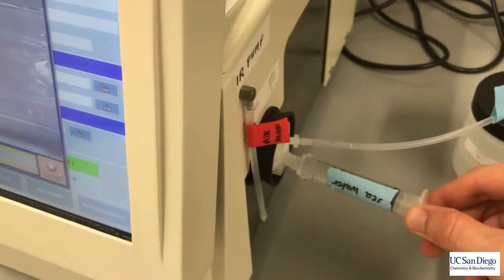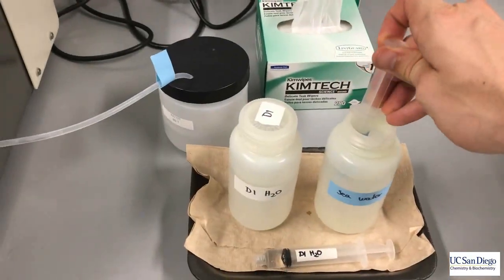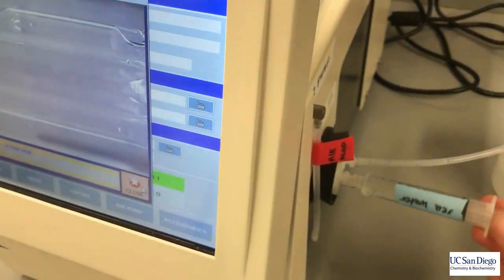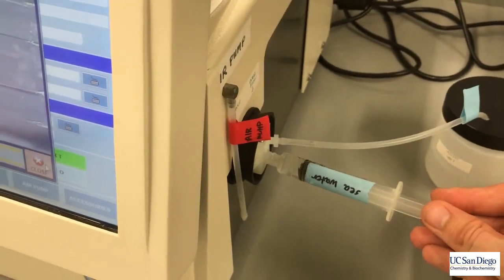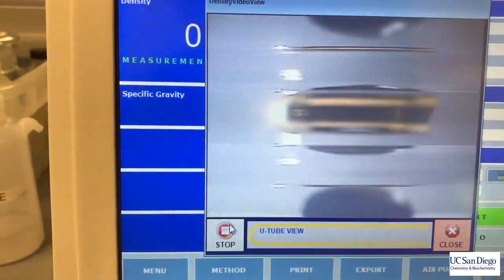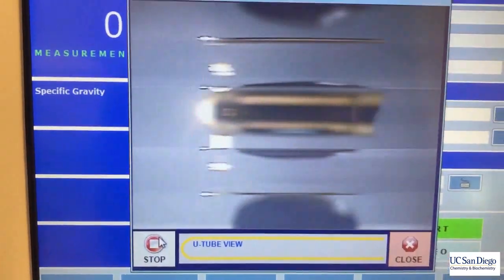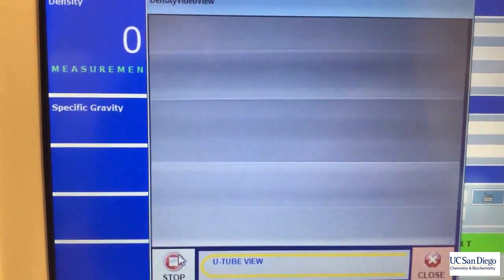Before you insert a sample or take a measurement for the sea water, you'll have to wash the U-tube three times. Consider what type of error would be introduced if we didn't do this.